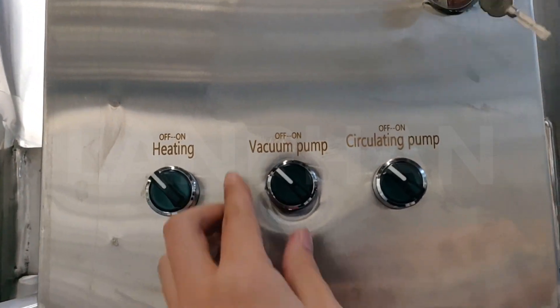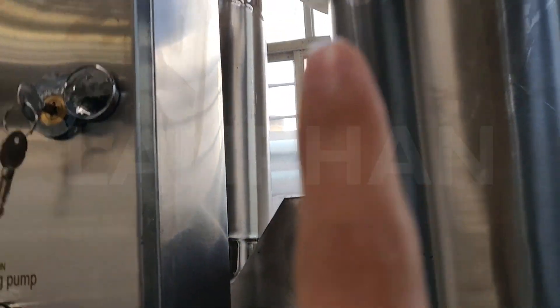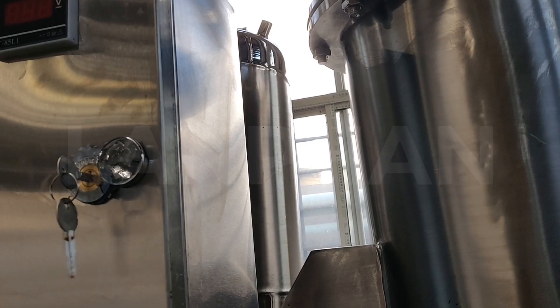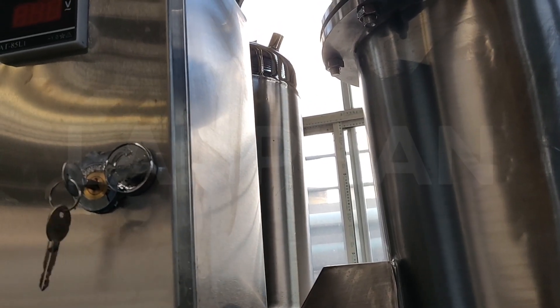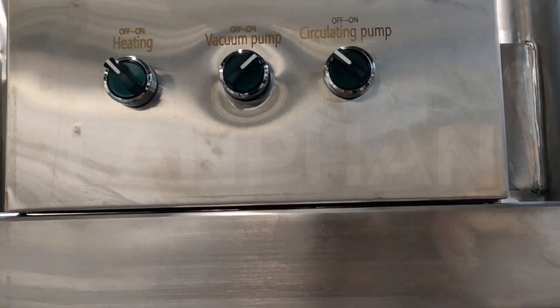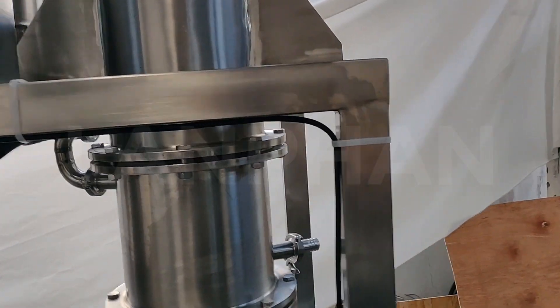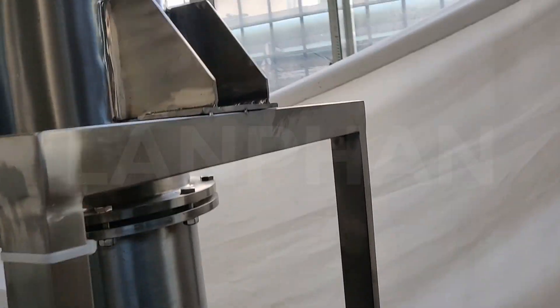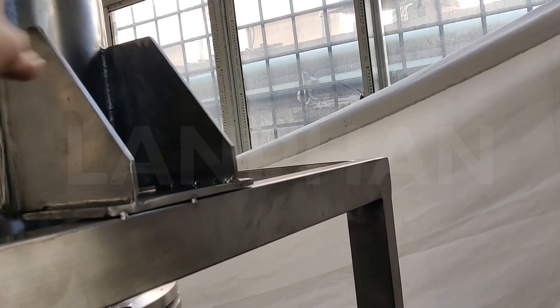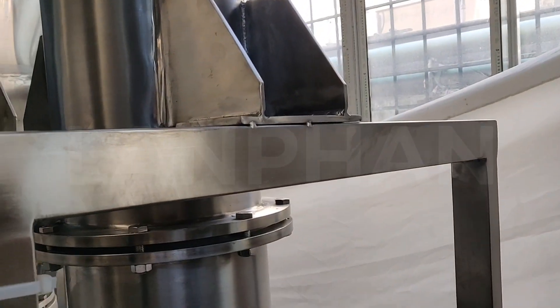Then we open the vacuum pump, and after we see the vacuum meter come to the hatched position, we open the next step — we open the chiller and connect the chiller with the condenser for circulation.